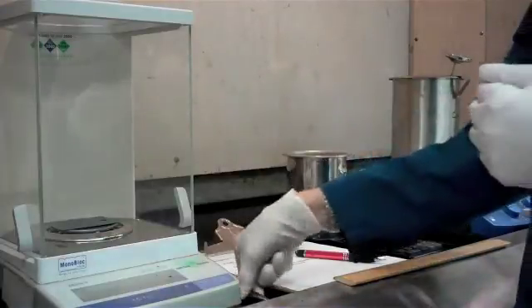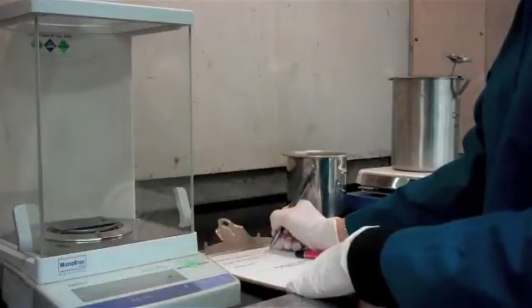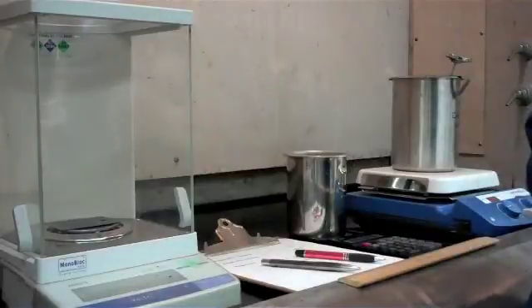So we've got a weight here — it's 22 grams .5252 — and we're going to write that down because we're going to need that number for our calculation later on.